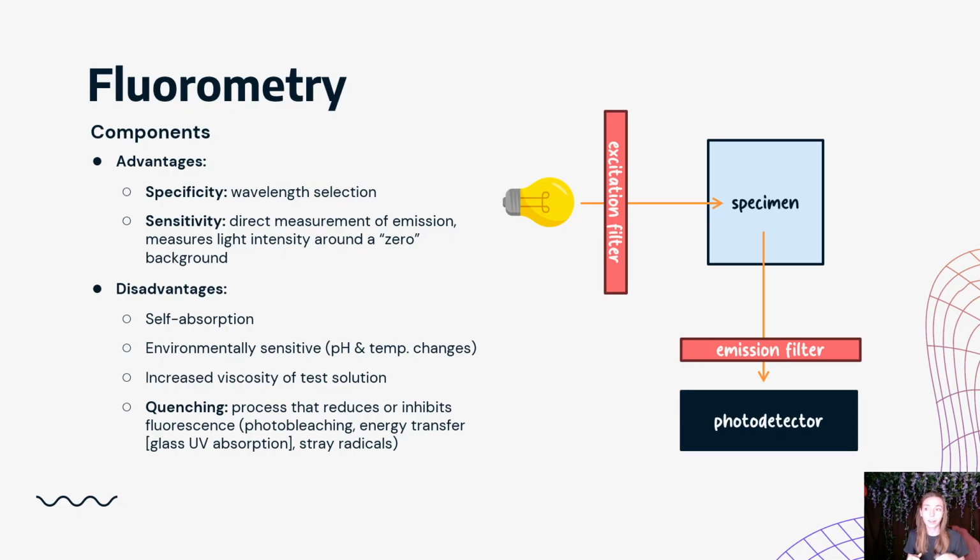You don't like that. The other thing, it is very sensitive to temperature changes and pH changes. So again, pH, temperature changes, you're talking about energy. If you start to have things interrupting a very highly sensitive method that's based on energy levels, it's highly sensitive. You have extra energy entering into the system. That's a problem because it's a sensitive little crybaby, right?